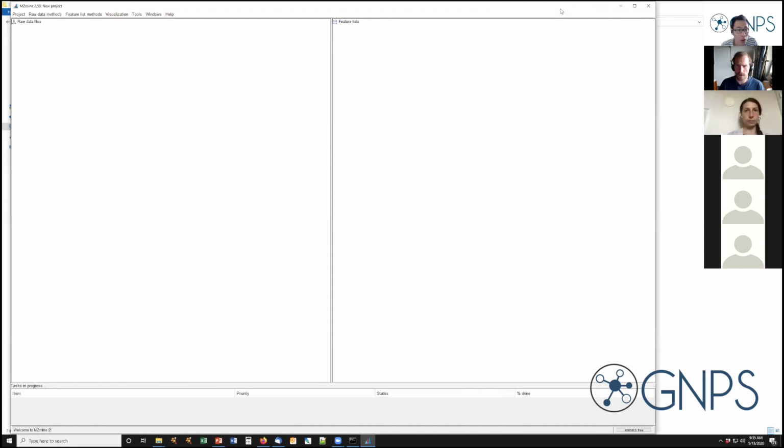We did not talk much about file conversion, so I mentioned it just a second ago. MSConvert is a very convenient tool. It's part of the ProteoWizard package, so that's all open source and available. We can also talk about that in the breakout rooms later if that is an issue. For now I think we're good on files, as the files we provided are all centroid. There's also extensive documentation on file conversion, which is really useful.